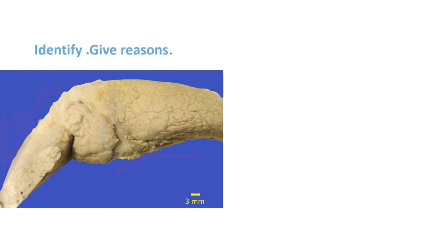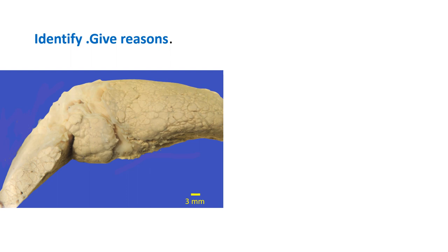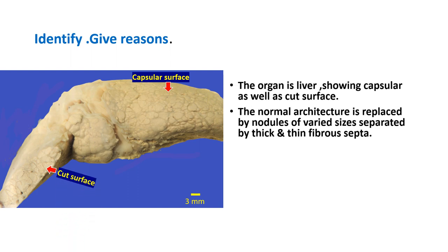This is the liver showing both the capsular surface and the cut surface. The normal appearance of the liver is lost and replaced by nodules raised above the surface. The nodules are of variable sizes and shapes, separated by thin fibrous septa. On the surface, the nodules appear slightly elevated above the capsular surface, and on cut surface they look like this. The size of the nodules is significant for classification of this condition.